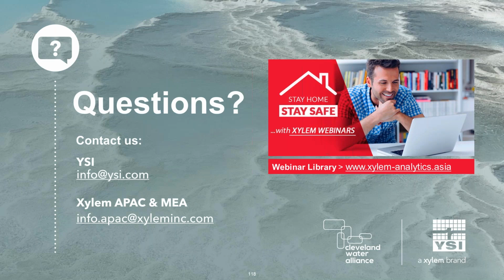Thanks for that, Zach. Just rereading over some of these questions, I missed a very interesting question. I'm glad I went back. Is it possible to use conductivity to assess oil spills? Yeah, absolutely. Oil being an organic compound, as we discussed early in the presentation, we can actually see drops in conductivity levels due to the introduction of oil in a water body or sample.